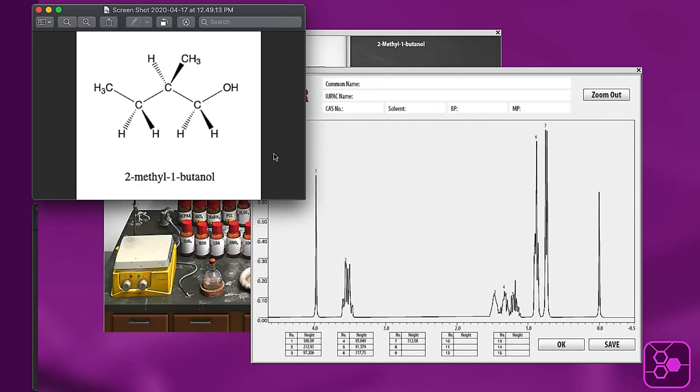Now I know that this hydroxyl proton is going to be deshielded and that it's going to be a singlet, and so I can assign that to peak number one here. That's a singlet, it's the most deshielded peak of all the peaks. So I would go ahead and assign that proton to peak number one.